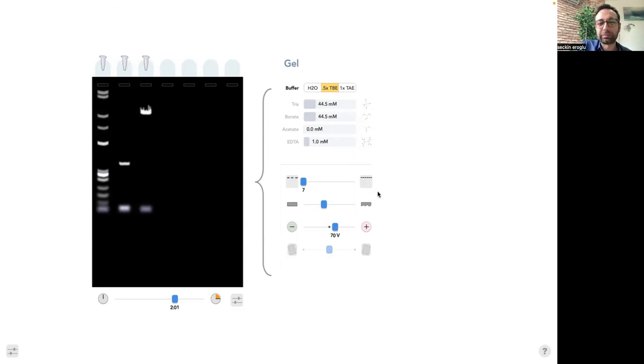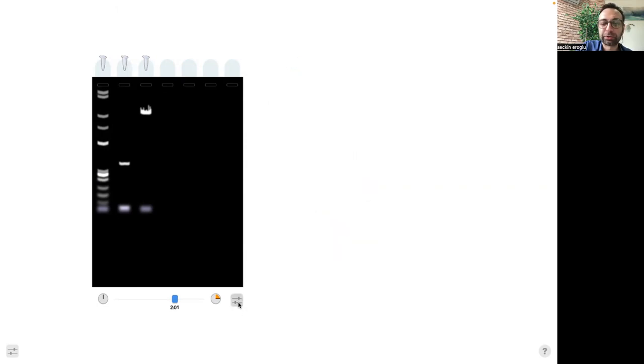That was it. The aim of this presentation was that you will do a lot of PCR, especially at the beginning. You will have a lot of problems. This is a simulator you can use. And when a problem happens, you will know faster what the problem is without asking anyone.